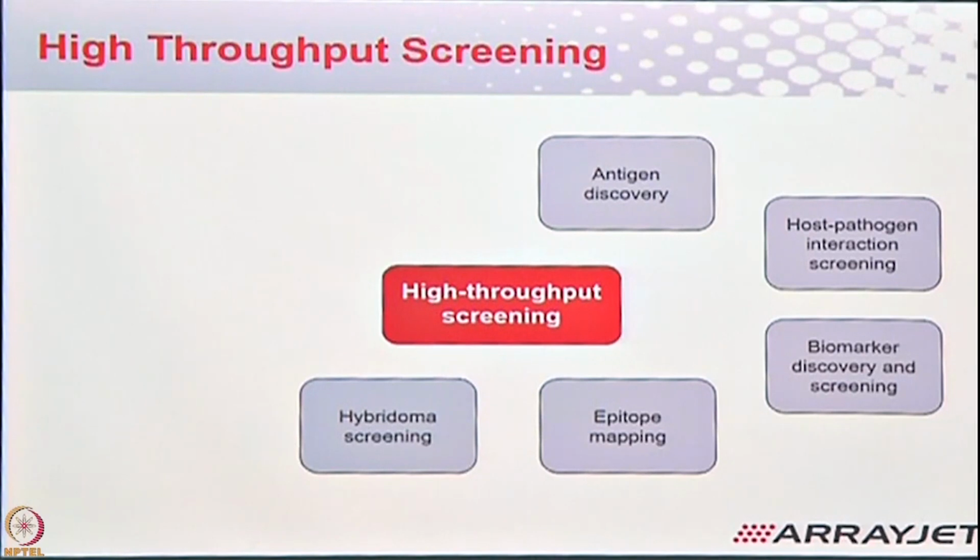They get printed off on one layer. So different lysates get printed off on different slides. Then you have your target antibody of interest that gets printed on top of each other. So you can imagine there is a spot and then there is another spot on top. And because of that binding of one spot to another spot, it's called a spot on spot assay. So it's a spot on spot type of printing, where you can make sure the entire interaction or the screening is done while it's getting printed.